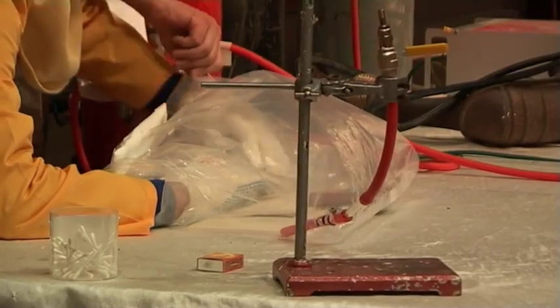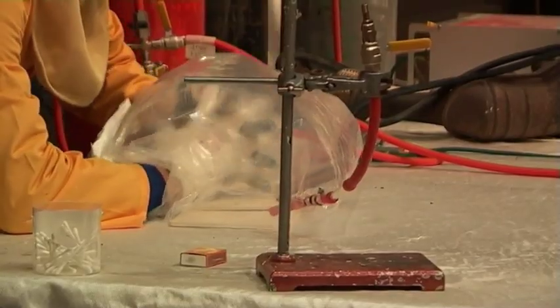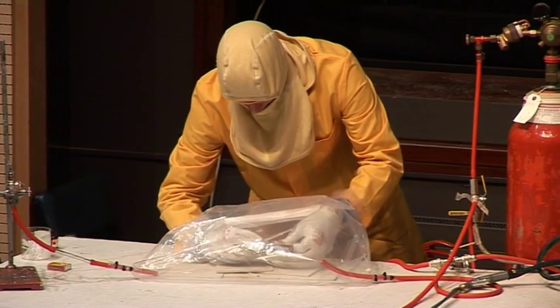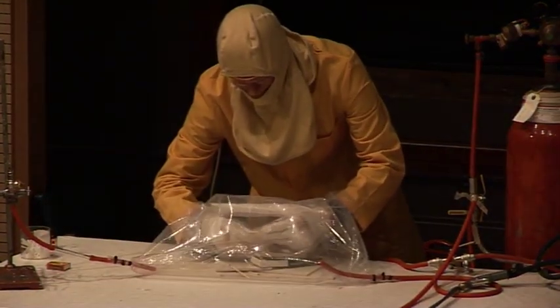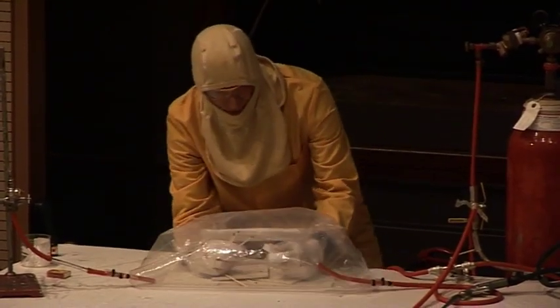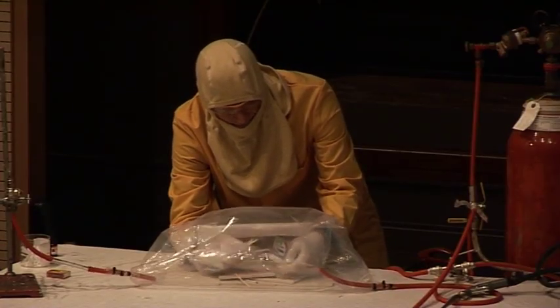Thank you. It occurred to me the other day when I was doing this, I should have been a vet. But anyway, right. Okay. Now, I have a match, and I'm about to strike the match inside this big bag of hydrogen. So watch carefully what happens.